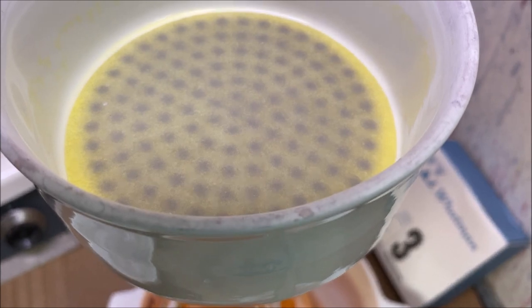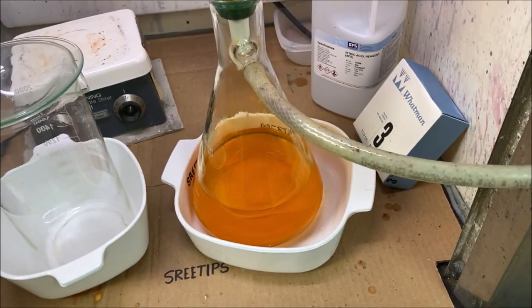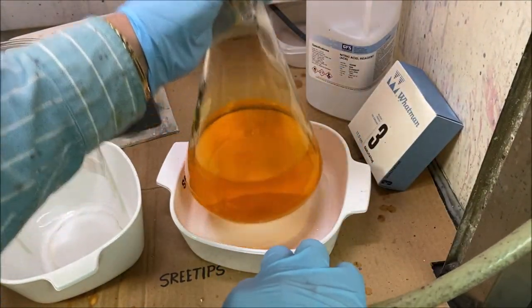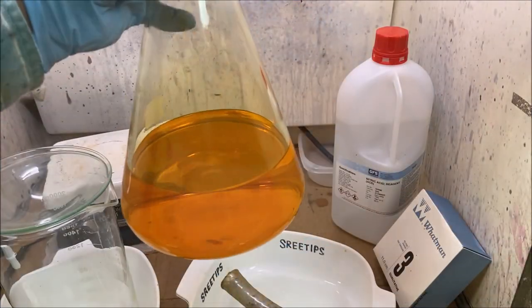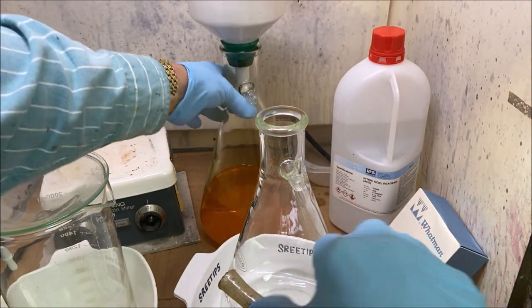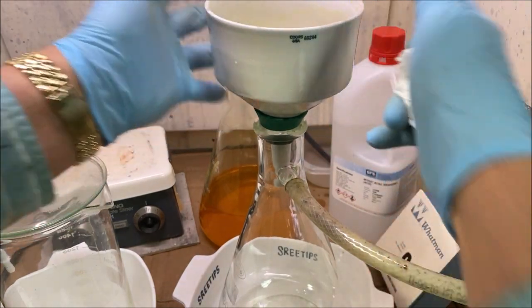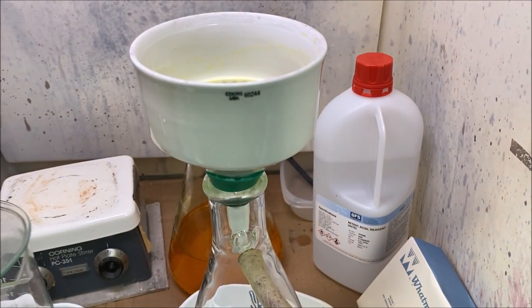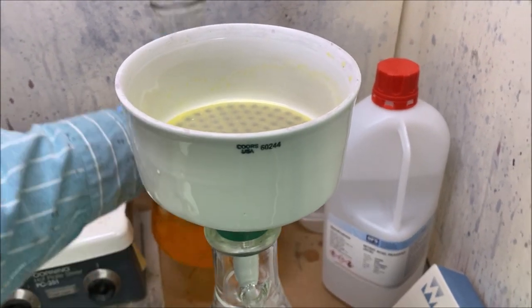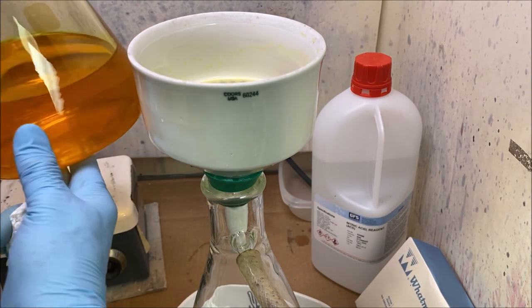Here's all the junk that we filtered out. If you look down here in the flask, it's a little bit cloudy. So what I'm going to do is put the funnel right back on another flask and pour the solution back through the same filter a second time. Now that the filter is loaded up with all that junk, we'll be able to filter some more of this cloudiness out, hopefully.